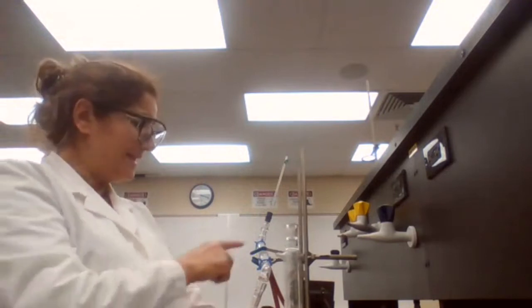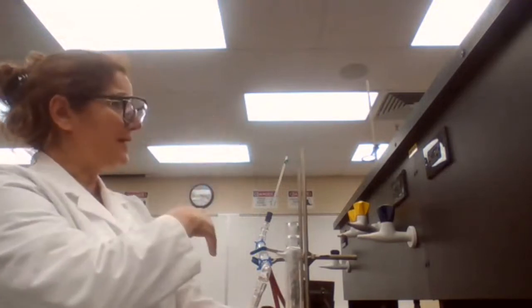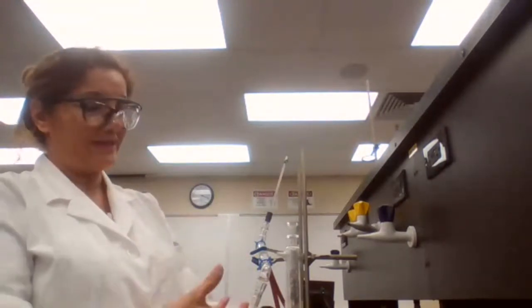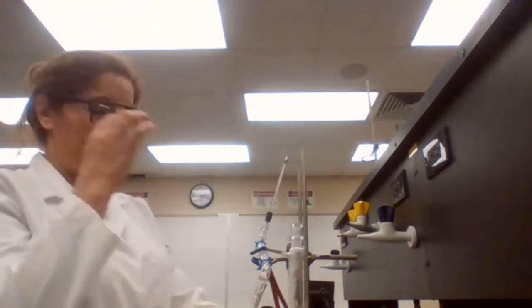So you didn't see any gap or drop in temperature for simple distillation. I did not see that based on the data that I collected today. But for fractionating column, there is a greater chance that when compound A is gone or is collected, the temperature drops because compound B has not reached the thermometer to show that increase in temperature. So that's based on the theory, the difference between simple distillation and fractional distillation.